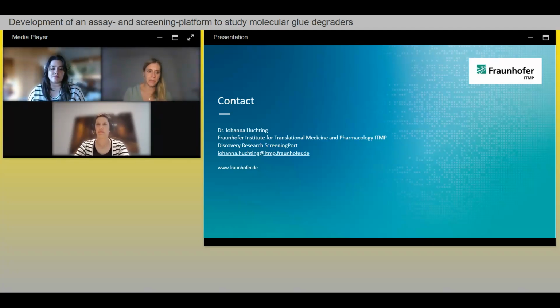But please keep in mind we are not controlling for cell viability in this case. If you would want to control for cell viability, we would want to either normalize to the protein amount, or we could run a housekeeping HTRF such as tubulin, for example, in comparison. And also keep in mind that the DC50 of indisulam is in a sub-micromolar range, while the toxicity that is beyond 25% of impacting the cell viability only comes in the single-digit or double-digit micromolar range. So two separate things that we can observe.